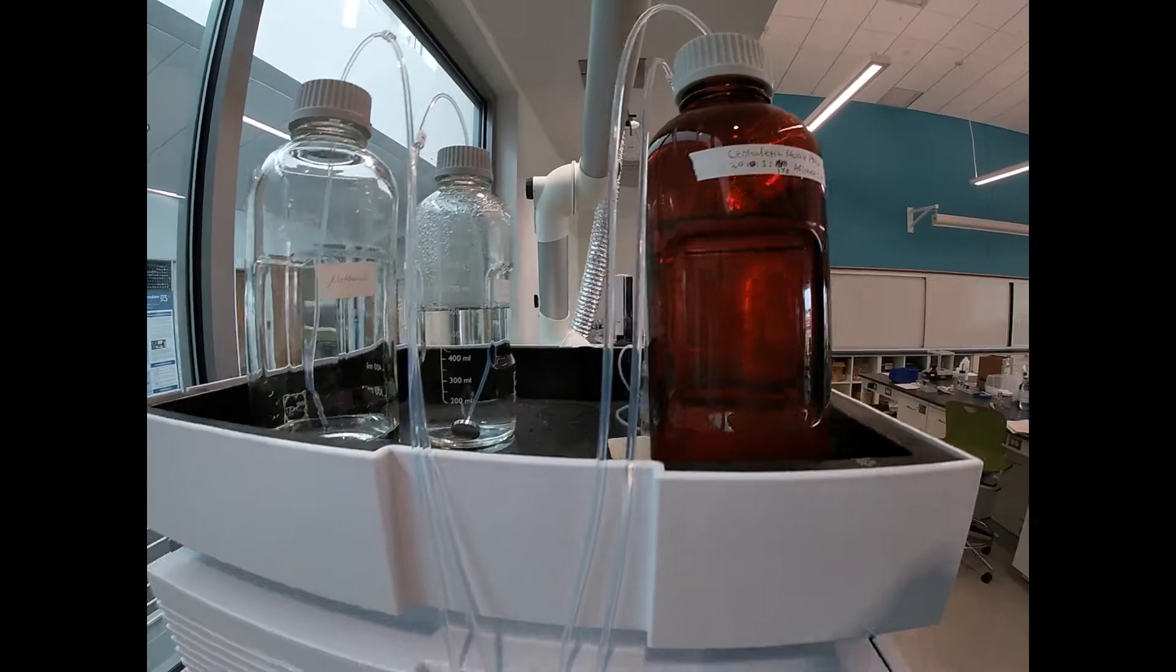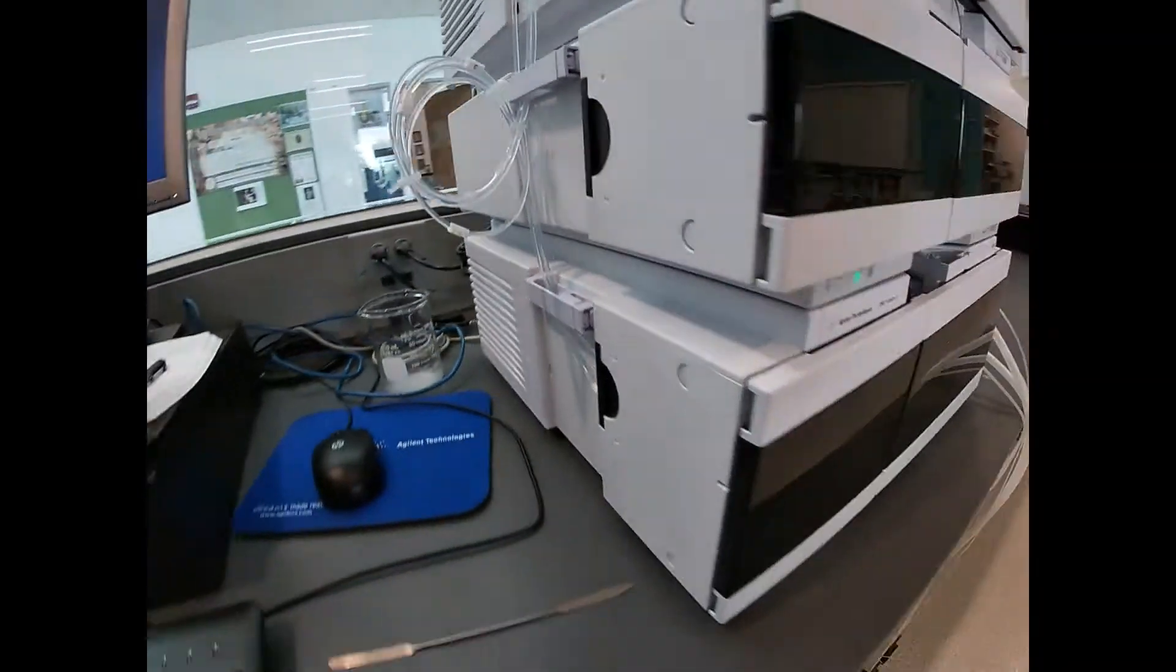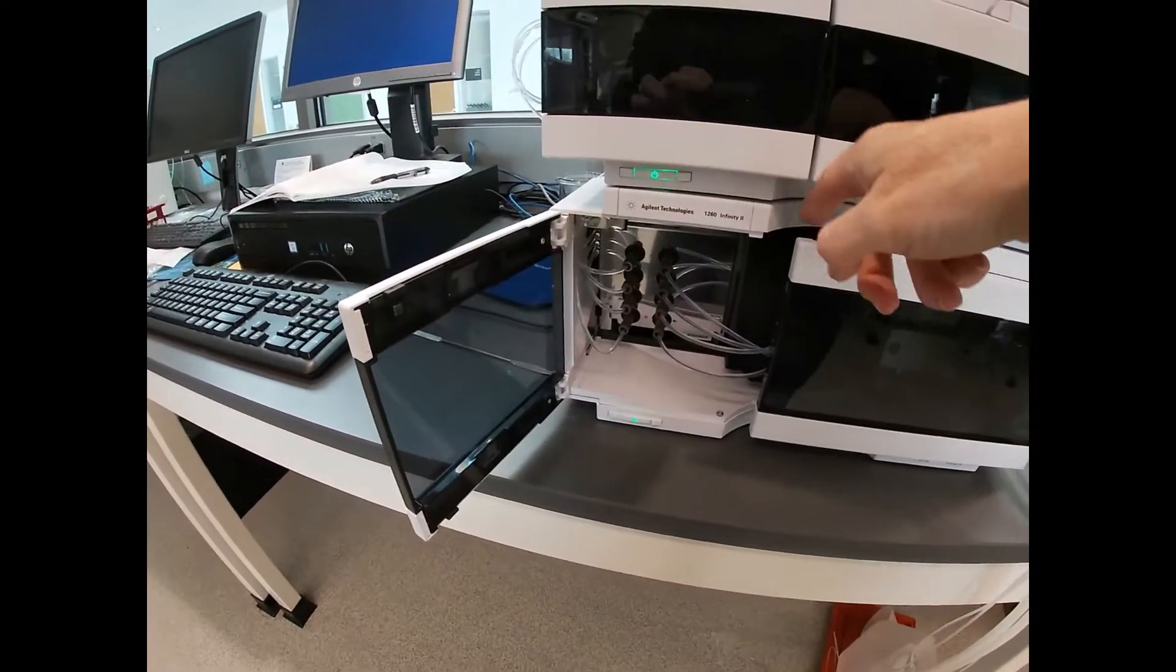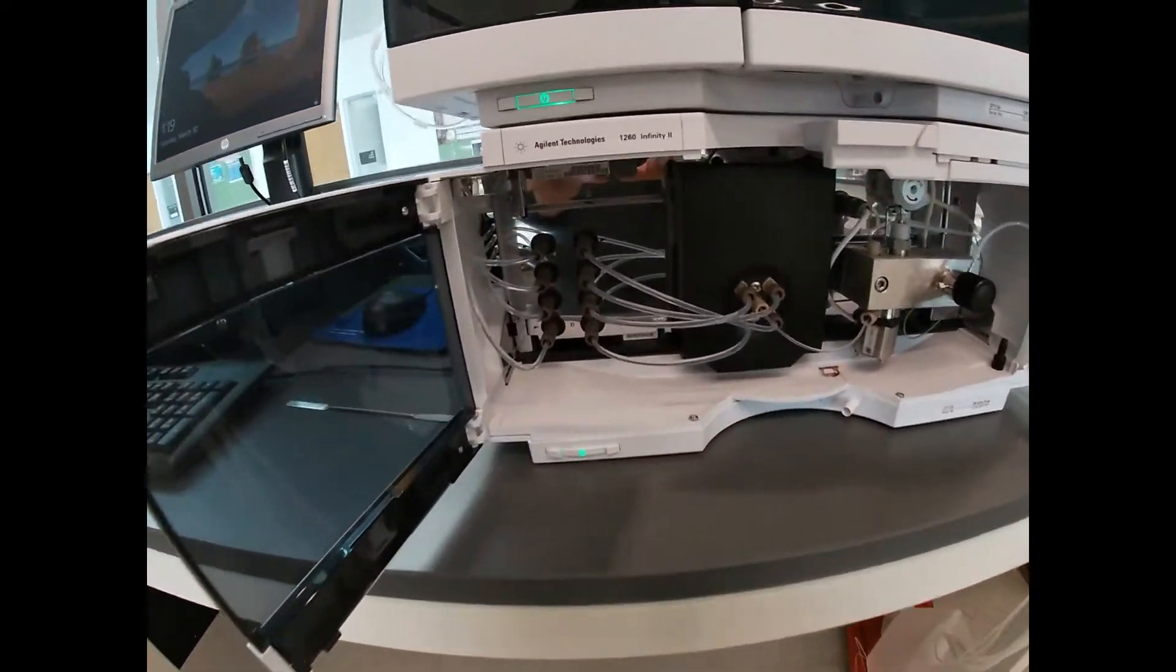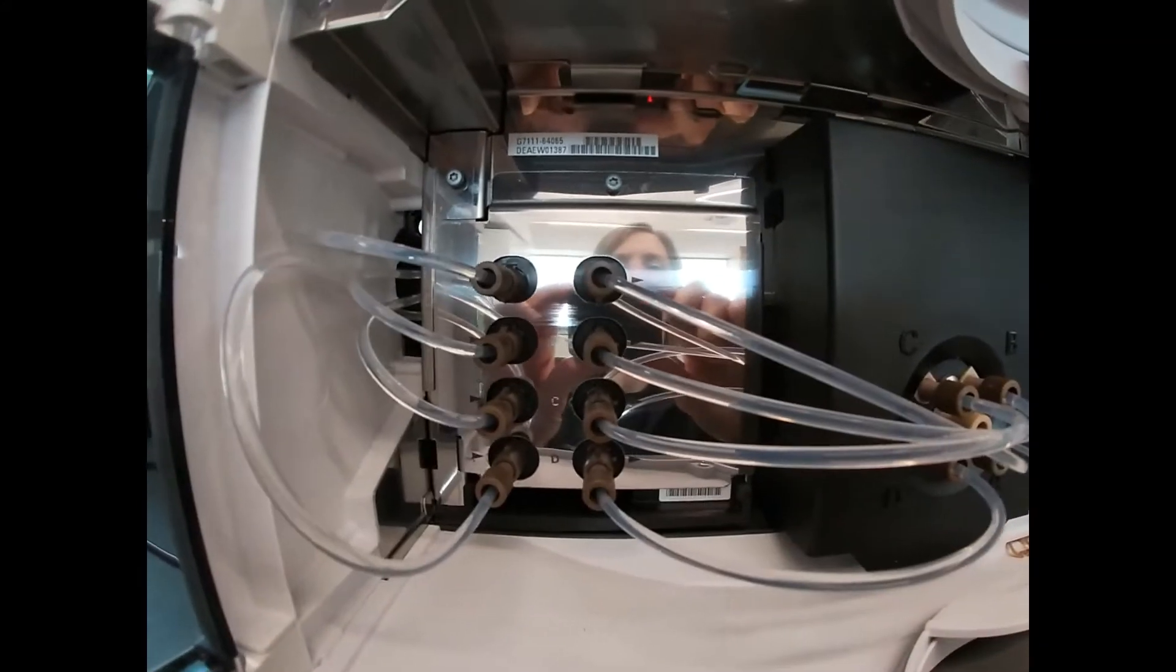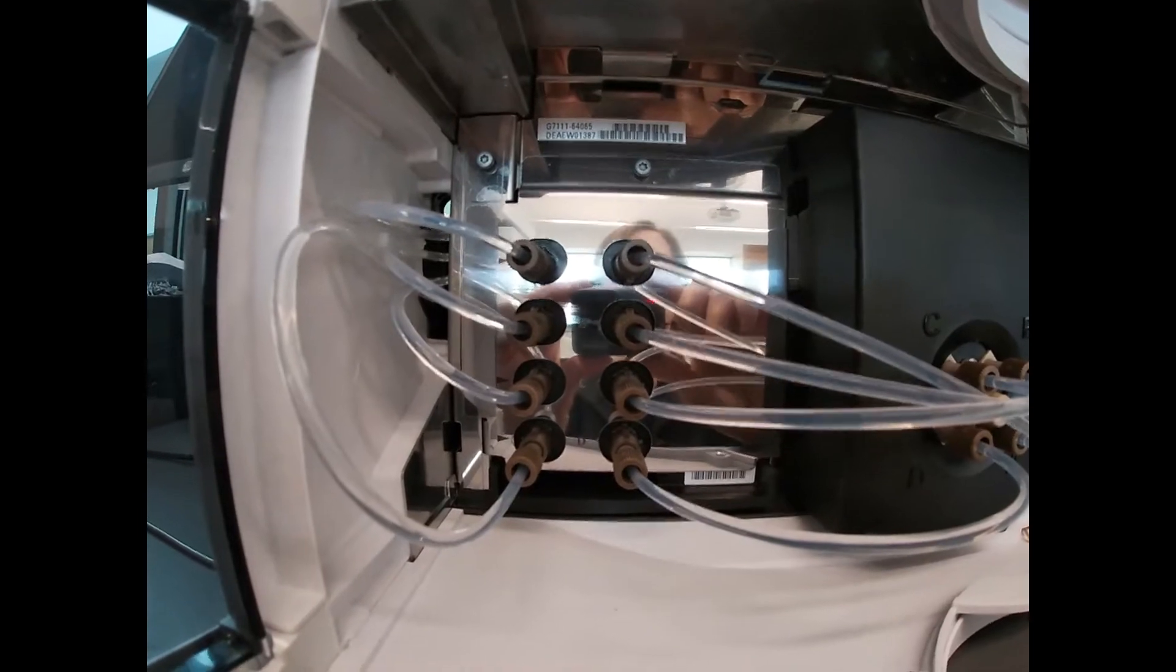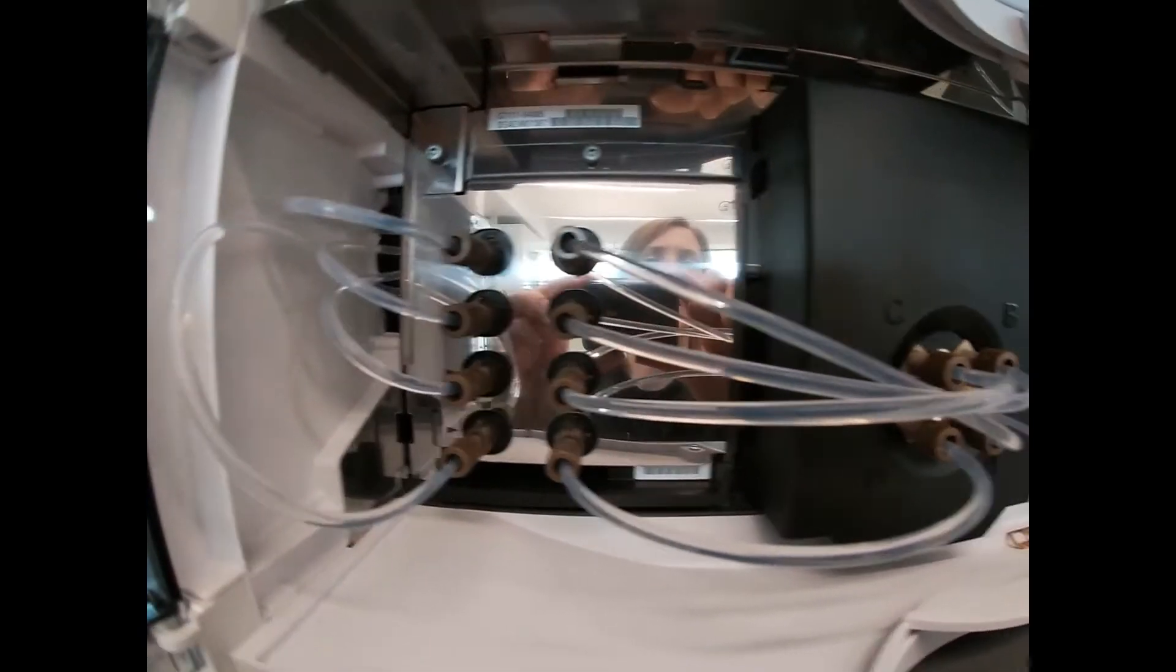Basically those come down these lines all the way down to our proportioning valve. Here we actually proportion how much of each solvent gets mixed together.